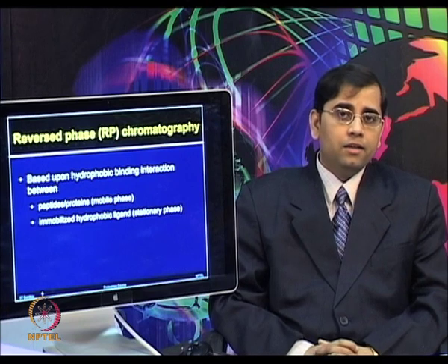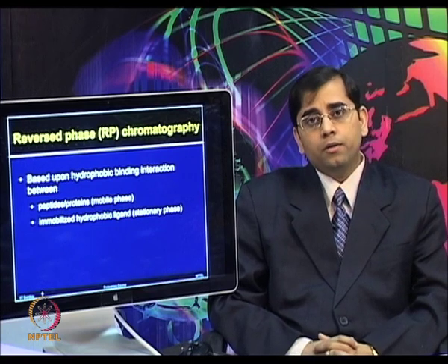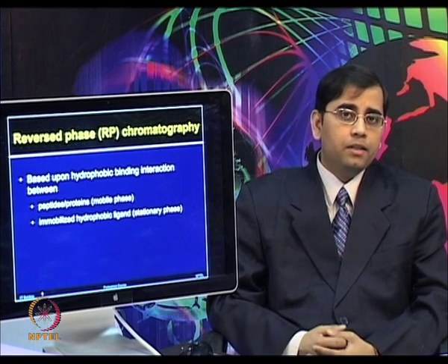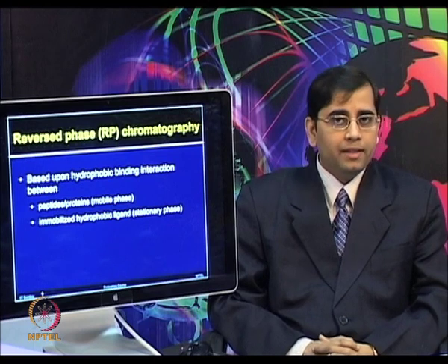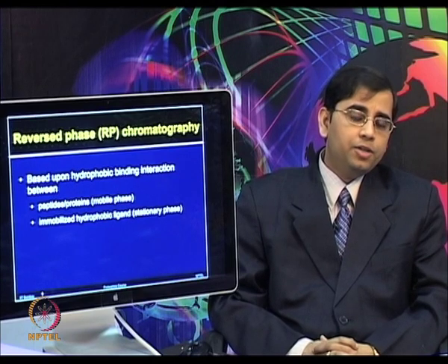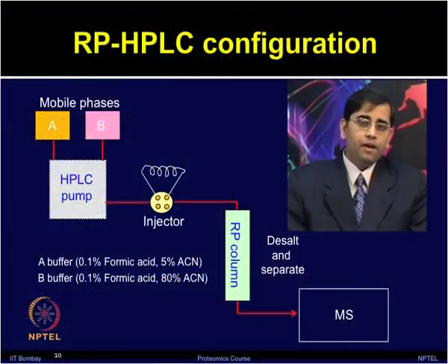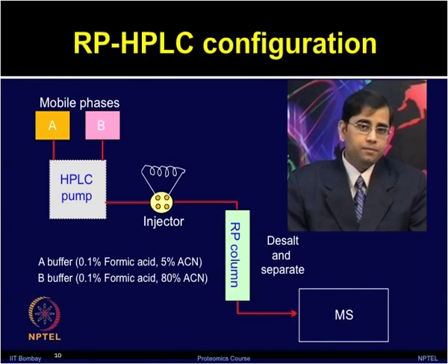By utilizing this hydrophobicity, one can separate the peptides. However, if your proteome mixture or the peptides are very complex, then one can further use another type of chromatography method such as strong cation exchange, and different types of multi-dimensional separation can be employed. In this slide, I have shown you the configuration for reverse phase HPLC.